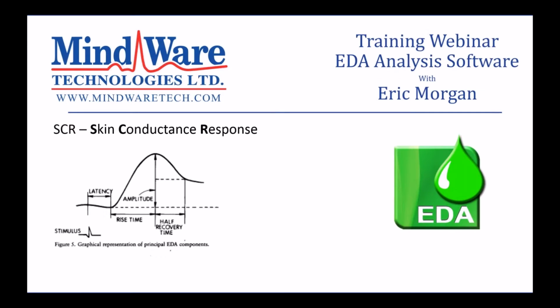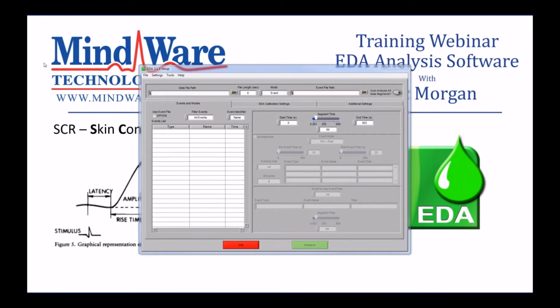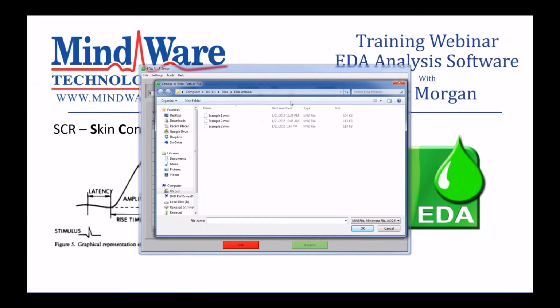So with that, I'm going to open the EDA application, and we're going to start looking at some of the basic configuration of the application. Okay, so with the EDA application open, I'm first going to go to the File menu and choose a file to analyze. I have 3 examples today, and I'm going to choose the first example to start with.